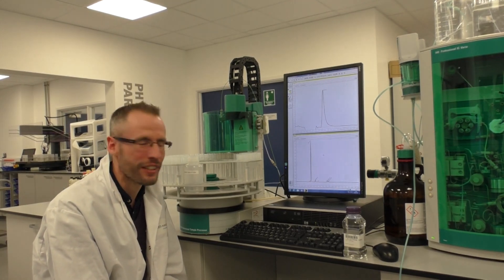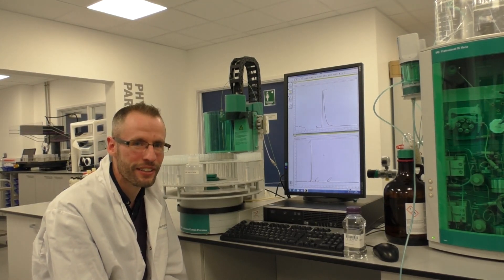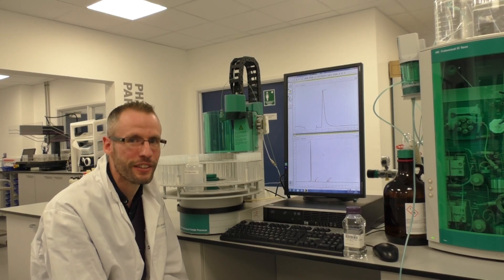Hello, I'm John Robertson from Southeast Water and I'm here today to show you our Metrohm IC unit.